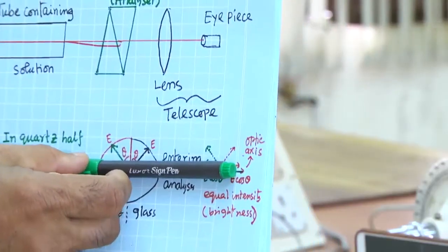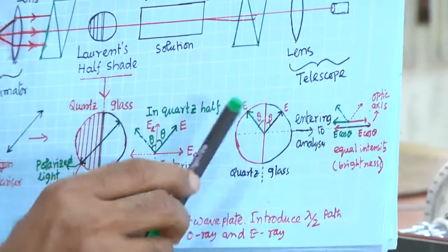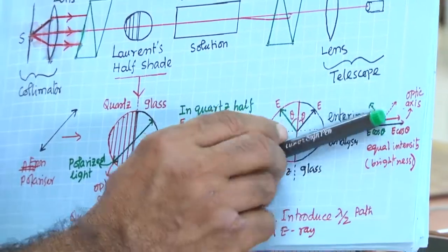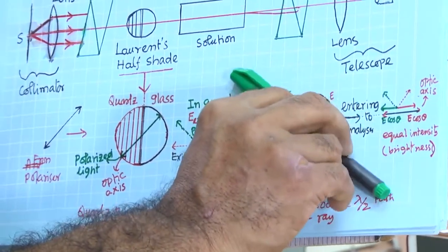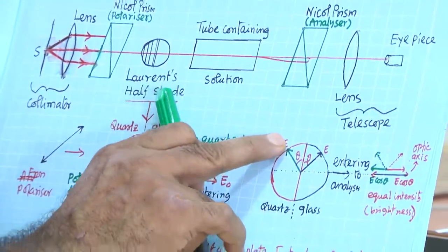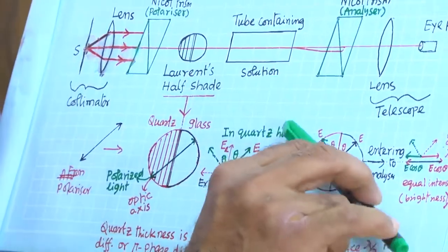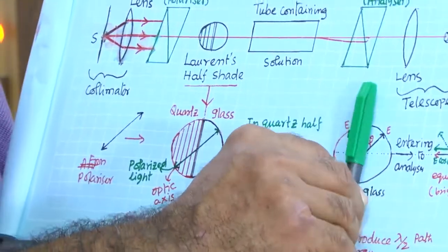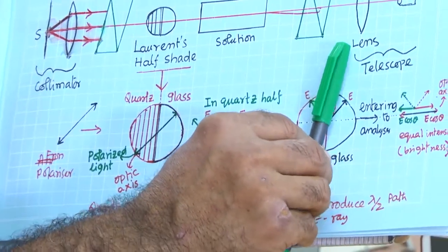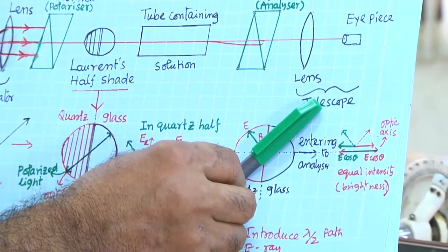Okay. So, again I will get the uniform situation. Then if you continue, again I will get this situation. 180 degrees opposite to the dark bright situation, I will get again a dark bright situation. Again I am continuing, then I will get uniform. Again I am continuing, I will get this dark bright situation.